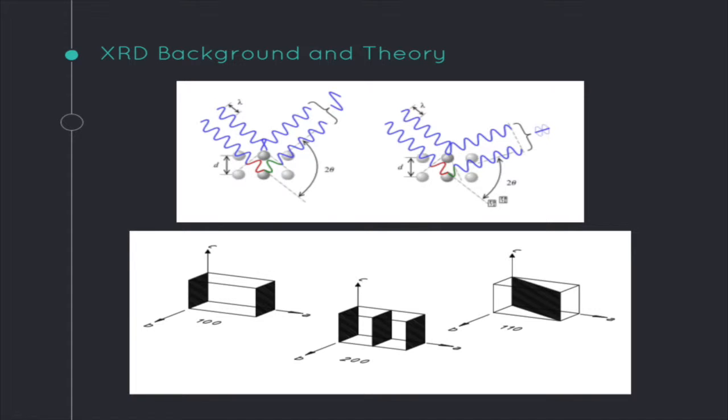For these reasons, a powder diffraction will be used in this lab, ensuring that all orientations of the crystal will be exposed to the X-rays. From this powder diffraction data, we will be able to determine the crystal structure and interplanar spacing of the sample.